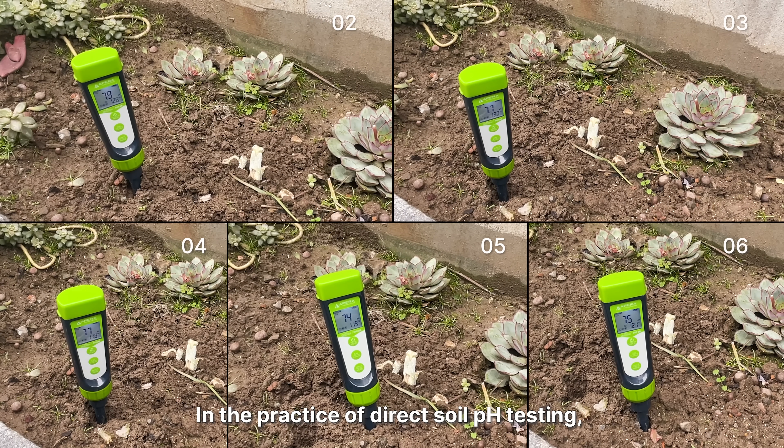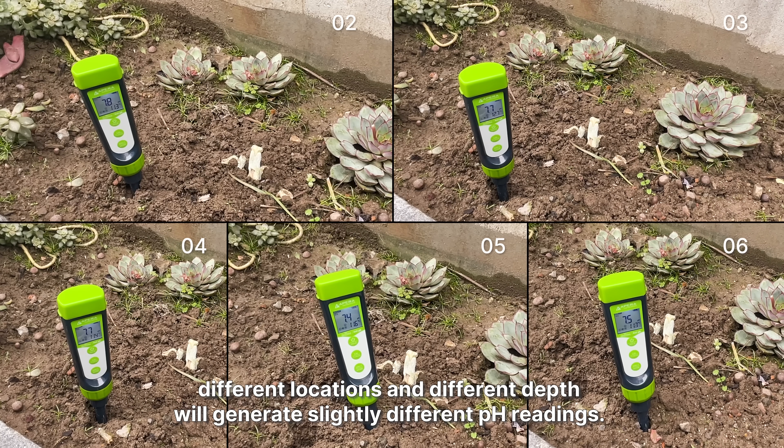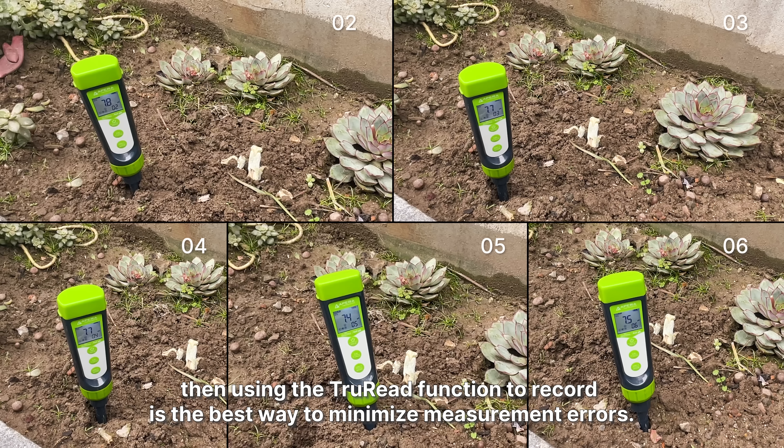In the practice of direct soil pH testing, as soil is not evenly distributed by its nature, different locations and different depths will generate slightly different pH readings. Therefore, selecting multiple locations while doing your best to stick the probe in at the same depth and angle, then using the TrueRead function to record, is the best way to minimize measurement errors.